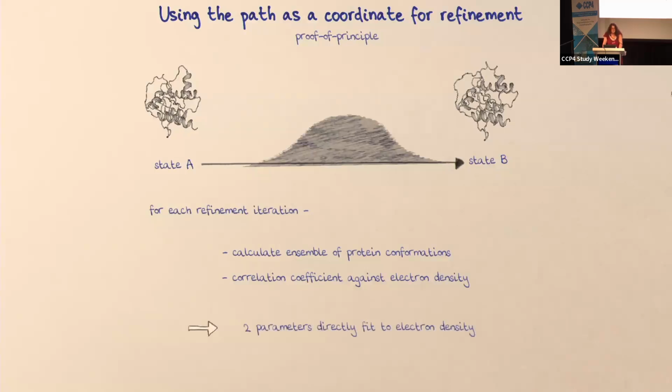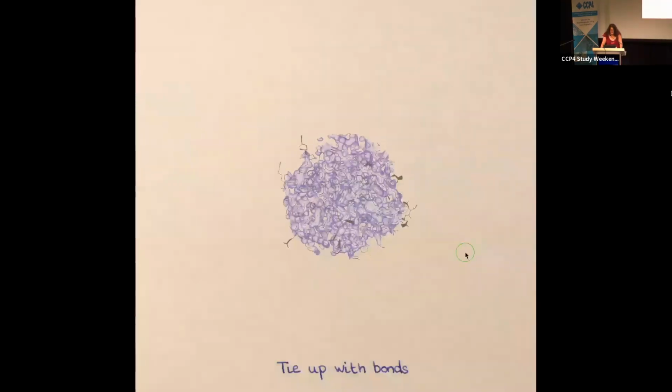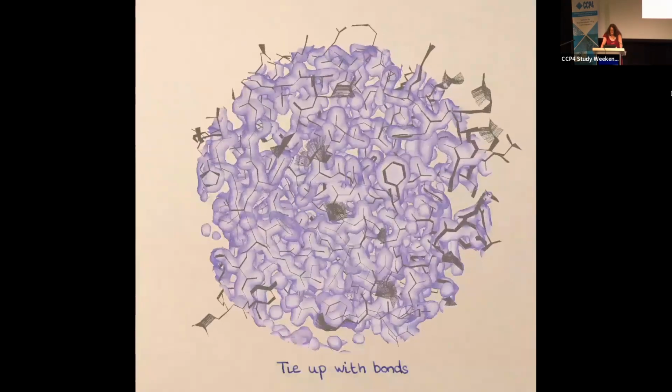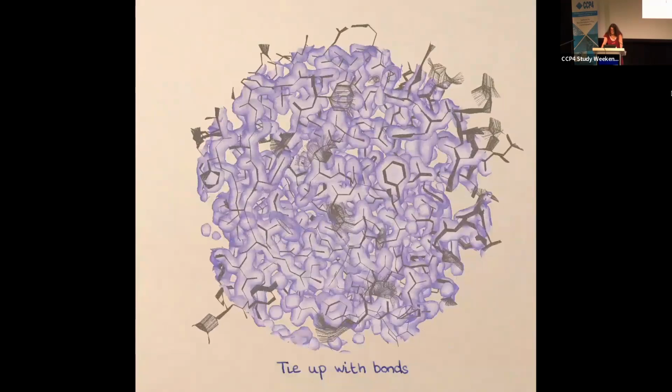So this is just two parameters, and if we now have a look at a little video of this happening, this is in real time. The protein here, I've chosen a protein with state A and state B, which are reasonably similar, and you can see that it's expanding to fill the electron density using these states in order to try and fill in the bits which are more blurry and keep the parts together which are more sharp.